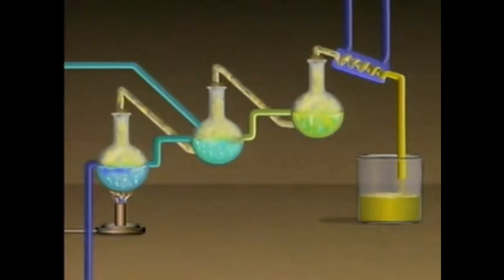This continuous distillation process system has 3 containers or stills, 1 heat source to boil the liquid mixture, 1 condenser, and 1 receiver to collect the condensed vapor. A feed line continuously supplies the system with a liquid mixture. During operation, heat is applied to the first still to boil the mixture. The vapors produced in this still rise and move into the second still.